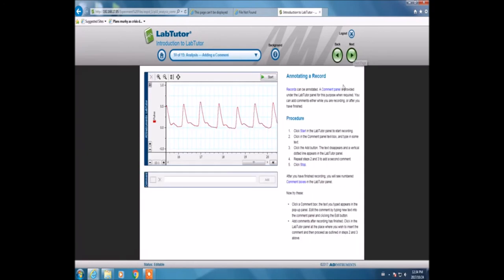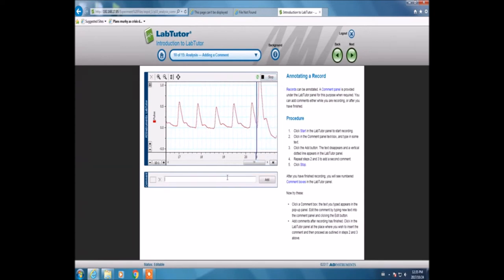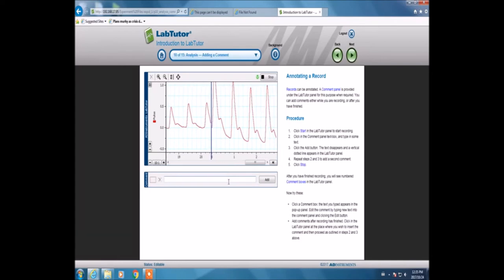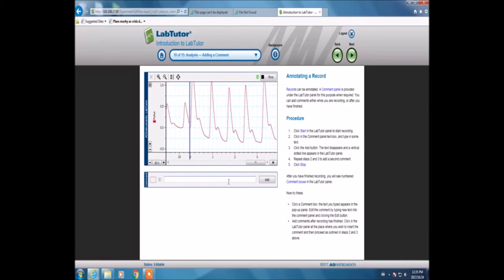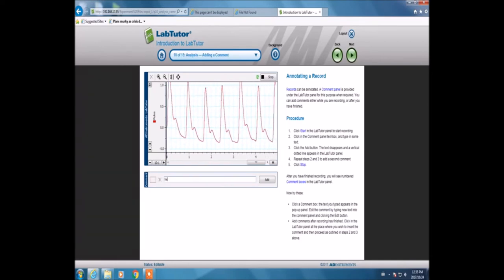Now we're going into annotations. This enables us to mark certain points on the graph with keynotes. We'll press start over here, write something in the comment, and add it onto the graph.